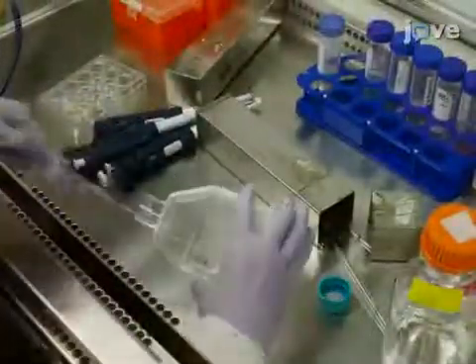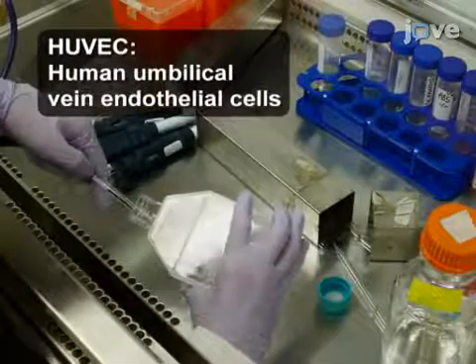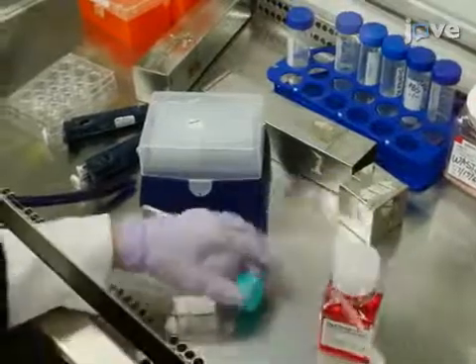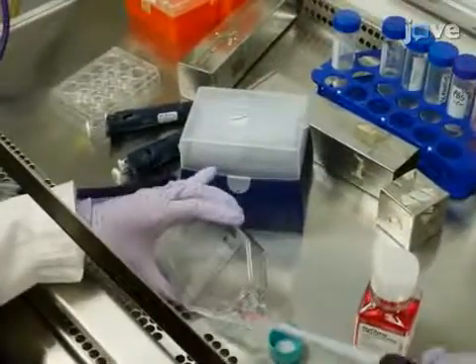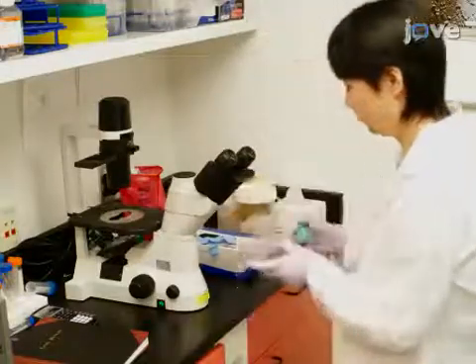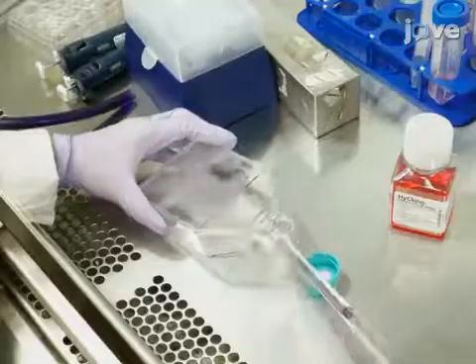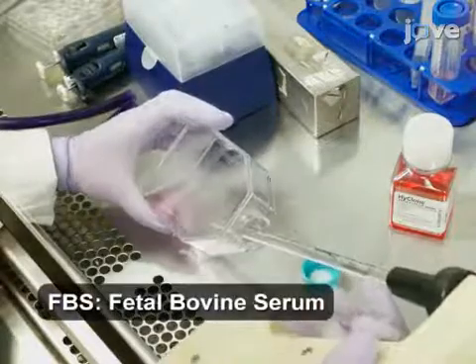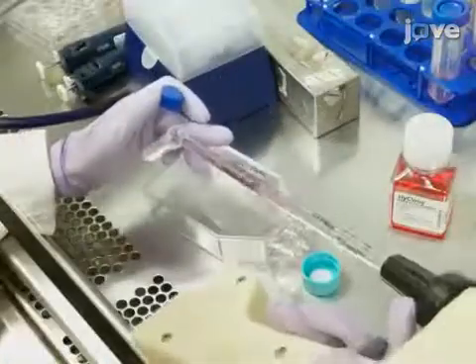After 30 minutes, wash the HUVECs once with PBS without calcium and magnesium and add 1 mL of 0.05% trypsin EDTA. Subsequently, incubate the cells at 37 degrees Celsius for 1-5 minutes and check them every minute until most cells round up. Then dislodge the cells by tapping the flask. Afterward, add 5 mL of basal medium with 1% FBS to the flask. Transfer the cells to a 15 mL tube, then centrifuge the cells.